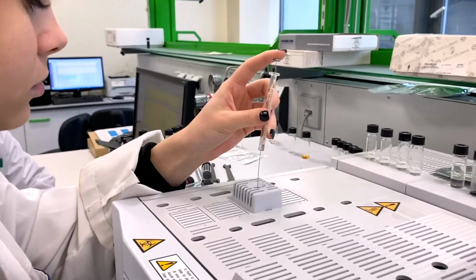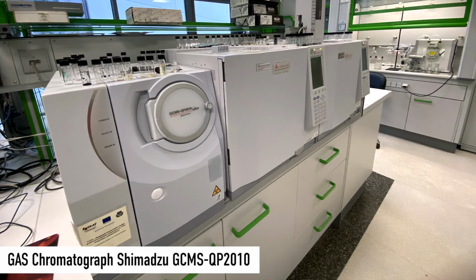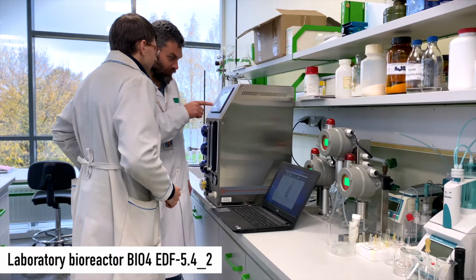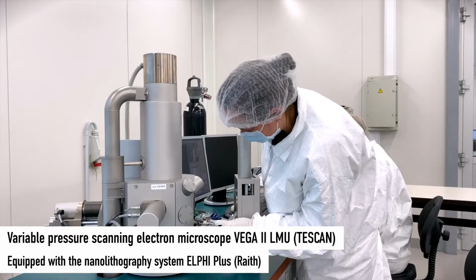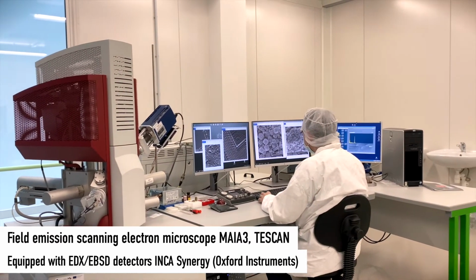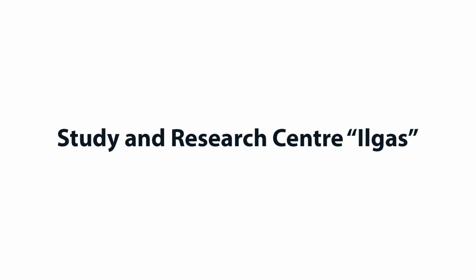In the laboratory of chromatography, intensive research on chemical analysis of environmental samples, fuels, food, etc. is realized. We have 8 gas and liquid chromatographs for solving various practical problems of chromatographic analysis, starting from control of environmental quality to developing more efficient biofuels. The Technology Department has several electron scanning microscopes which are used in the studies of various biological objects and nanostructures, as well as nanostructures of biological origin.